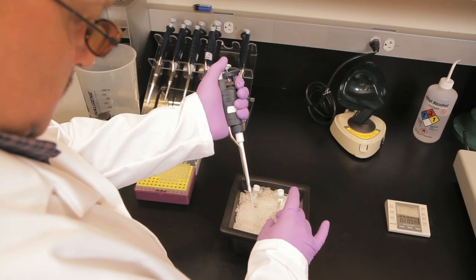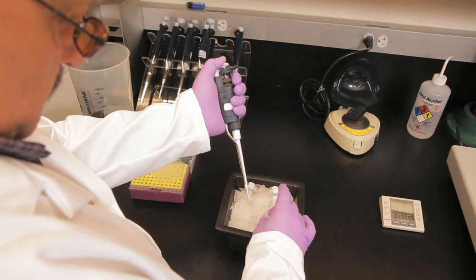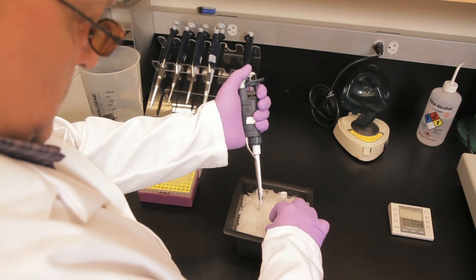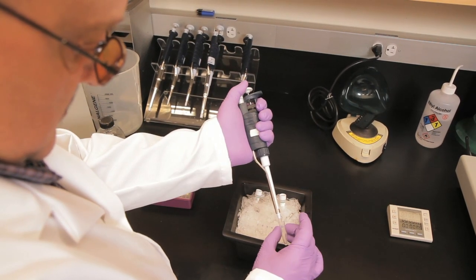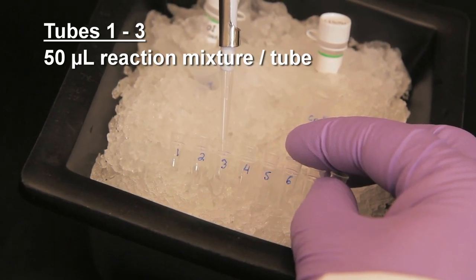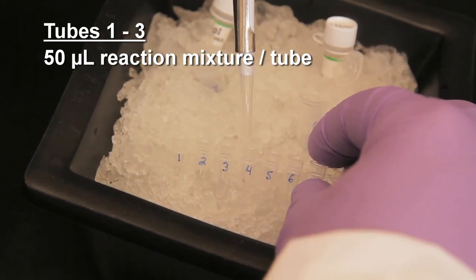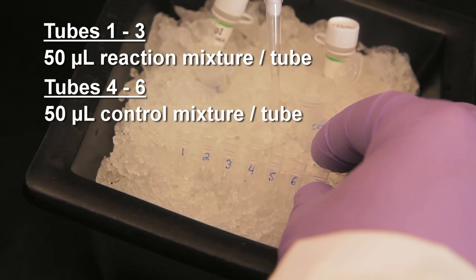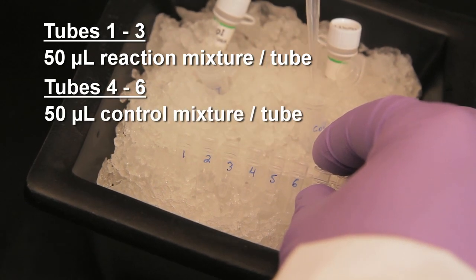To begin the restriction enzyme digestion, aliquot 50 microliters of the reaction mixture into each of three 0.2-milliliter PCR strip tubes labeled 1 through 3. Then aliquot 50 microliters of the control mixture into each of three PCR strip tubes labeled 4 through 6.